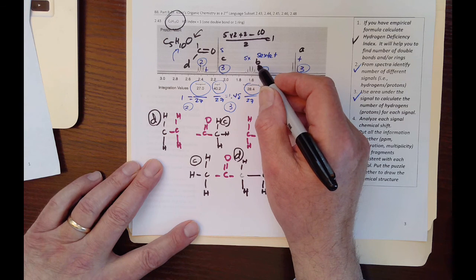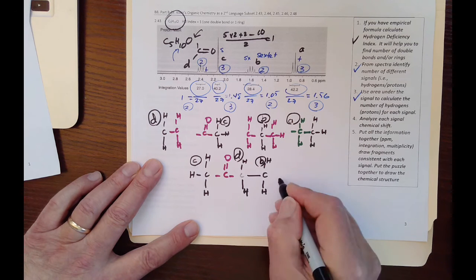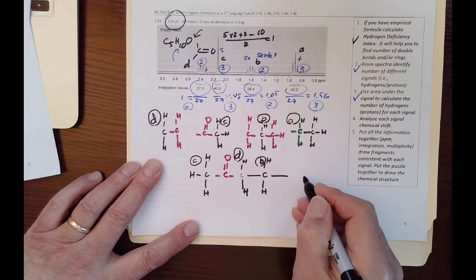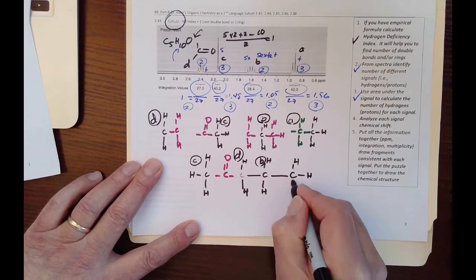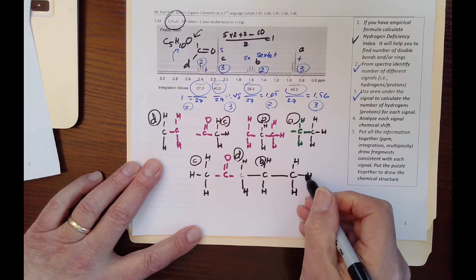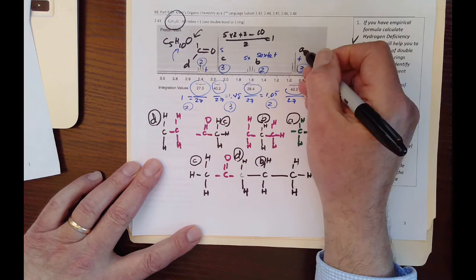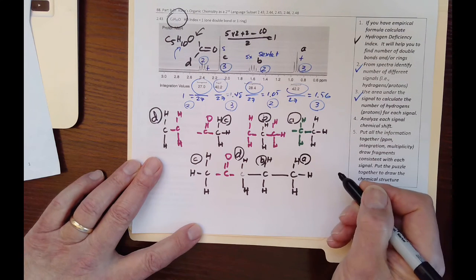So that matches now, because if I put B here for these 2 protons, I can put the other methyl group next to it. That's the methyl group that became a triplet, which is A. So this is my A. So this jigsaw puzzle is solved.